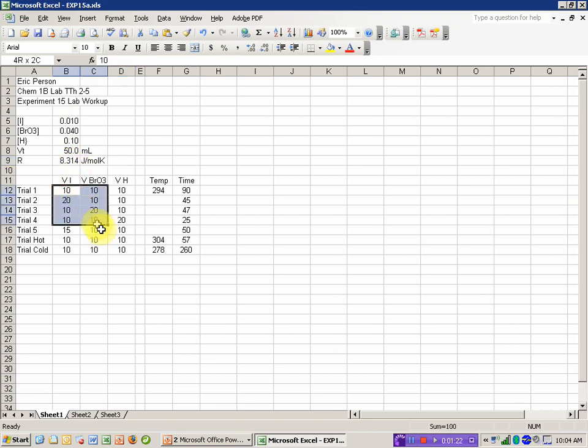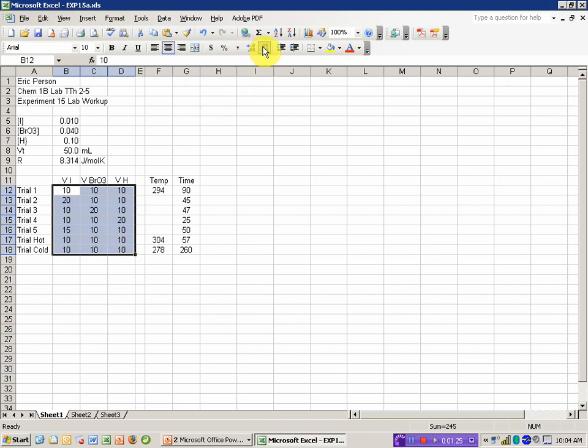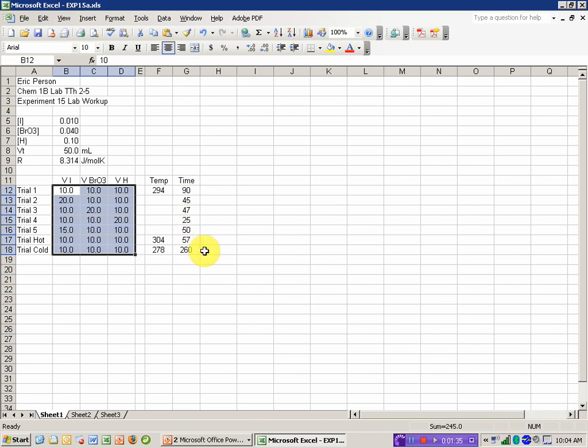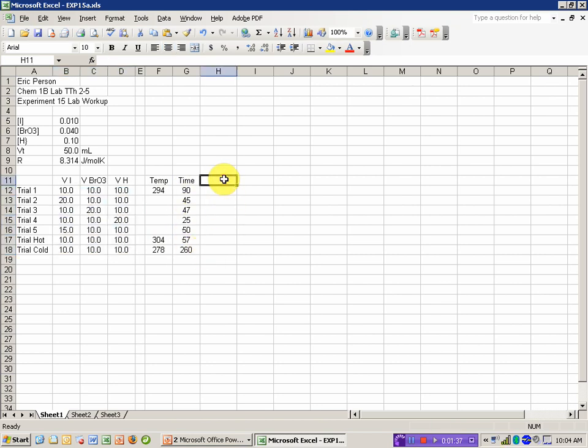I can adjust an entire range of cells using the increase-decrease decimal, if I'm trying to go to the same number of digits after a decimal place. The temperature I'm happy with, my time I'm happy with, so I'm ready to keep going.